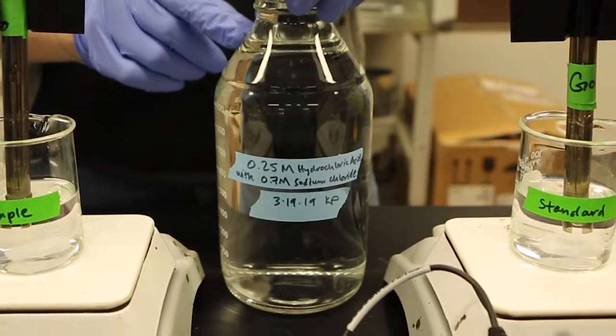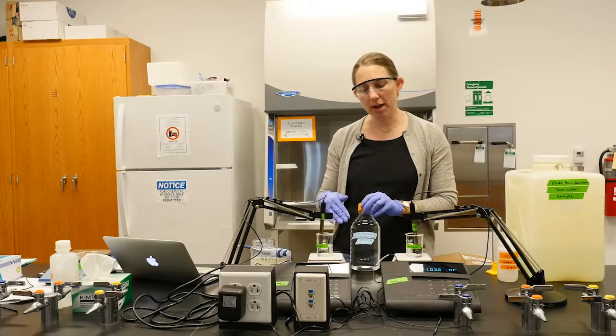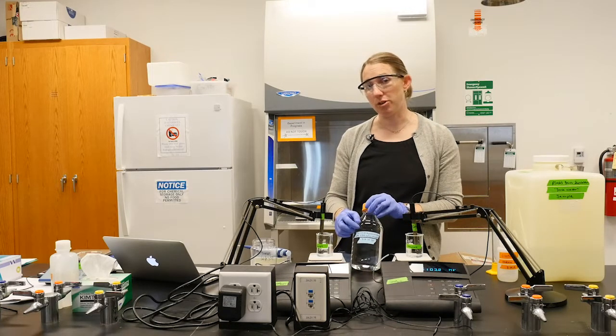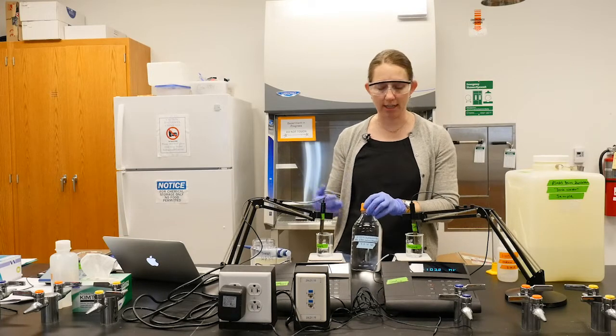The acid that we're adding is 0.25 molar hydrochloric acid, and then we've also added salt, so it has roughly the same ionic strength as seawater. So it's hydrochloric acid with 0.7 molar sodium chloride. So basically salt, to make it a similar salinity to our seawater.